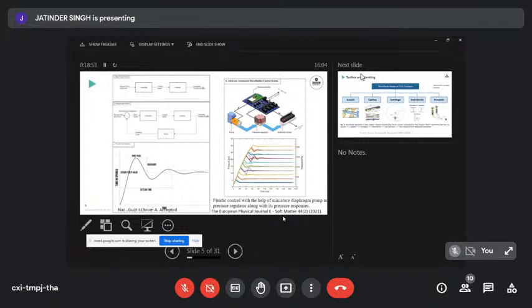So pneumatic systems, if you want to have really smooth flow, are good, but befriend a good electrical engineer because the commercial systems are $15,000 per channel. So a good pneumatic control system, buying them off the shelf, is expensive, but with some flow sensors and understanding what you want to achieve, home-built systems are good, and there's a growing number of open source systems available where people have done it before.